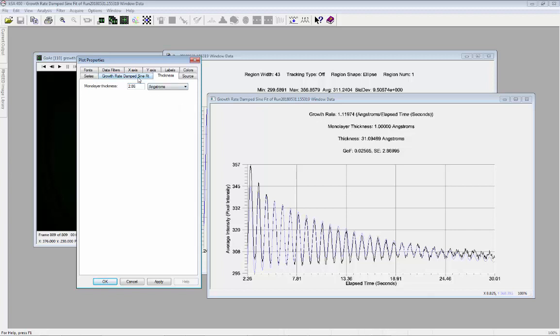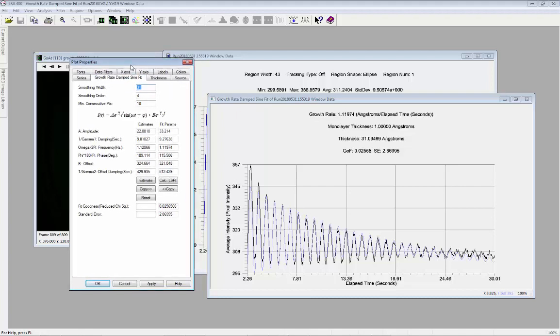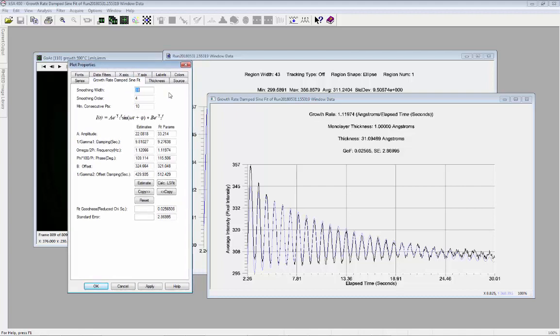Now select the Growth Rate Damped Sine Fitting tab to open the fitting dialog. The fitting function is an exponentially damped sine wave plus an exponentially damped background with 6 free parameters. The fitting routine requires initial estimates of these parameters, which are automatically calculated from the extrema. As is the case with any fitting routine with this many free parameters, the results can be quite sensitive to the initial estimates supplied.